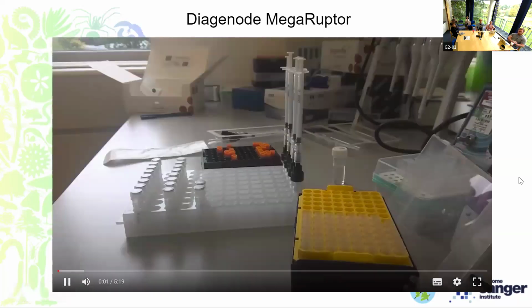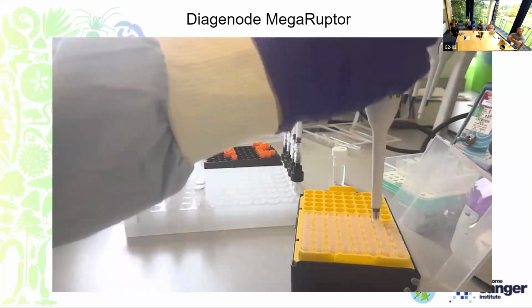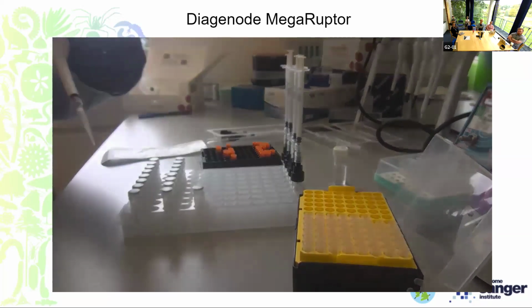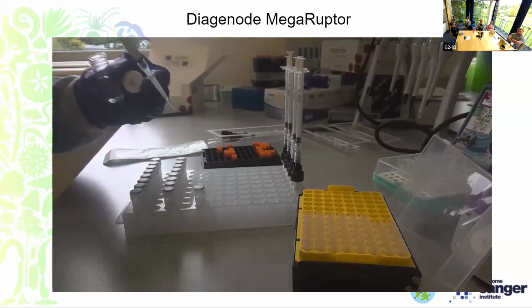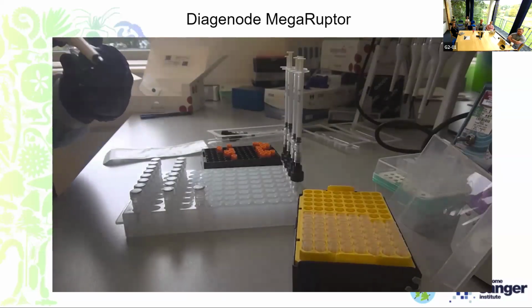So first off, we have our megaruptor. For the megaruptor, we have these screw cap tubes and syringes, which attach to the top of the tubes, and we transfer our DNA into these tubes and then top up any sample with EB buffer.